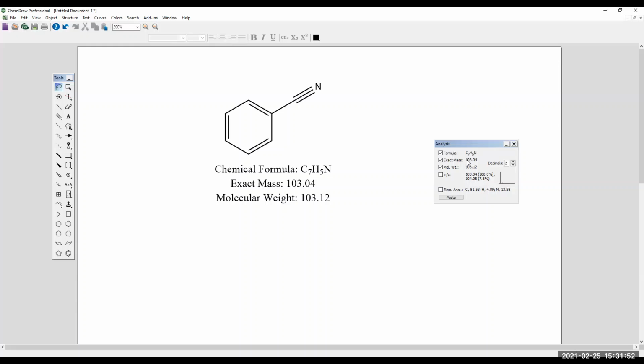All right. And then just to note, I said this earlier, but all of this data is predicted data. So this is predicted based off of previous data, and then it's pulling from ChemDraw's database to analyze this. For experimental purposes, or if you were going to publish this or do a presentation on it, you would need to compare this to experimental data to get a good analysis.